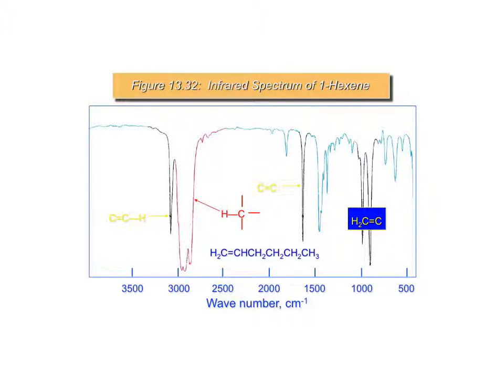Okay, so this was hexene. I wish I would have put the hexene and hexane right next to each other. If you remember, the hexane looked one way, and with this one we actually see a difference. We have this little peak right here that wasn't there before. The numbers would be shifted somewhat. And then the fingerprint region is completely different. It doesn't look the same whatsoever. And believe me, this is blown up because they modified the y-axis.